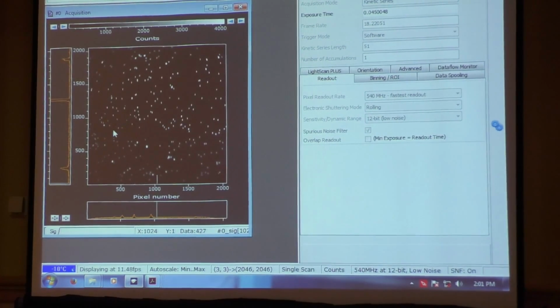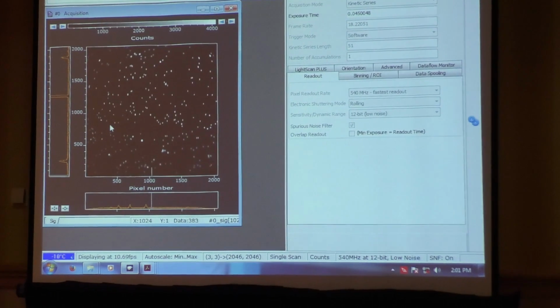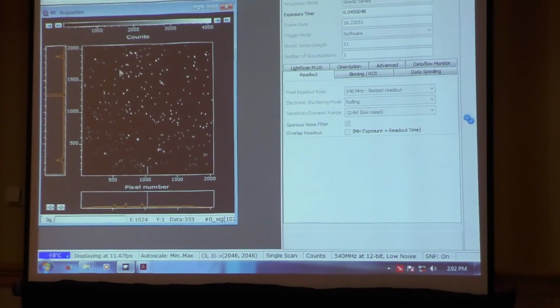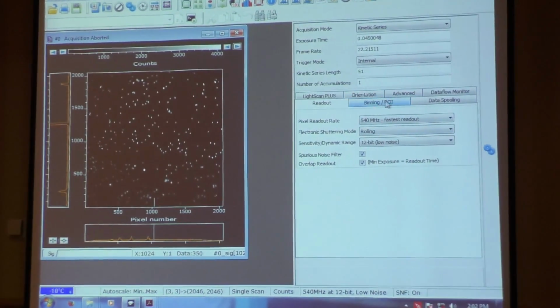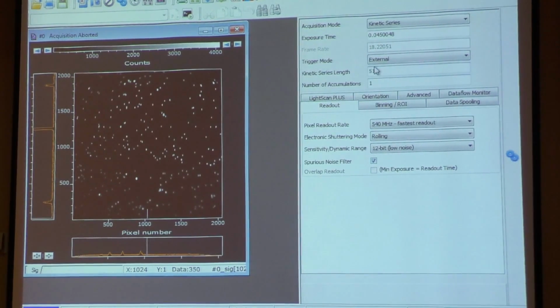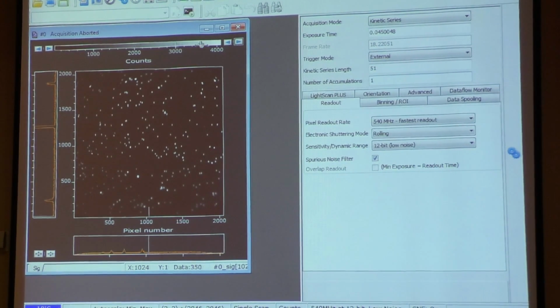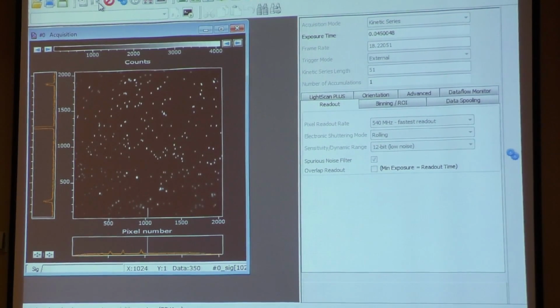Well, using point sources like this is one of the best ways to probe your optical performance. And so basically, what we're setting up now is a Z-stack. You ready? Where all we do is we say, okay, let's take a number of steps that are a certain distance away from each other, right? And get a start button.